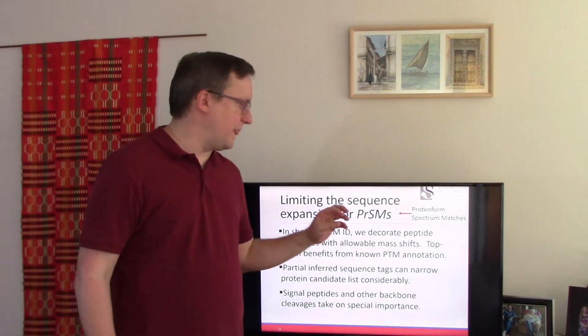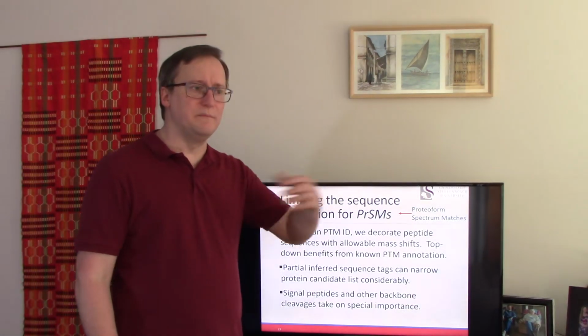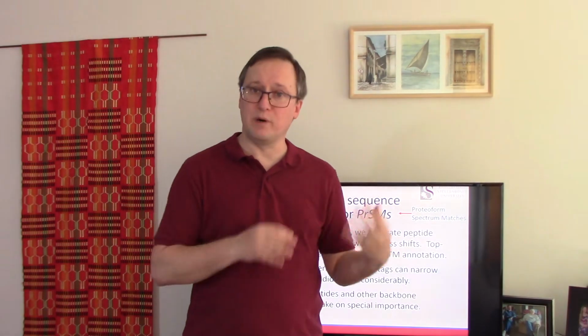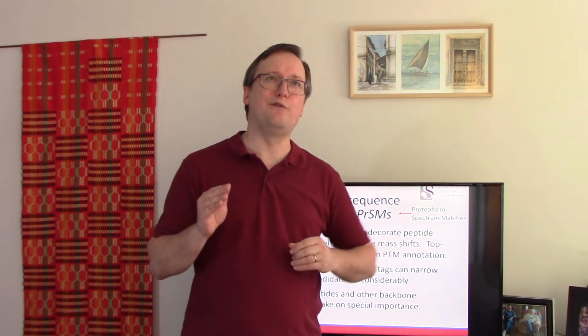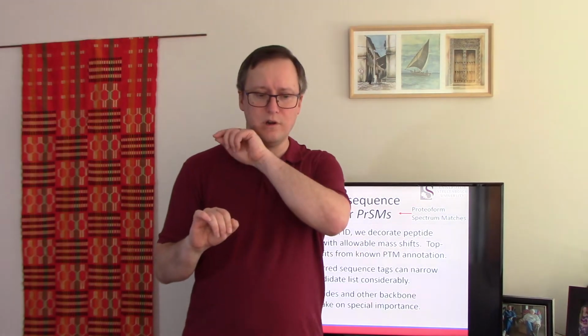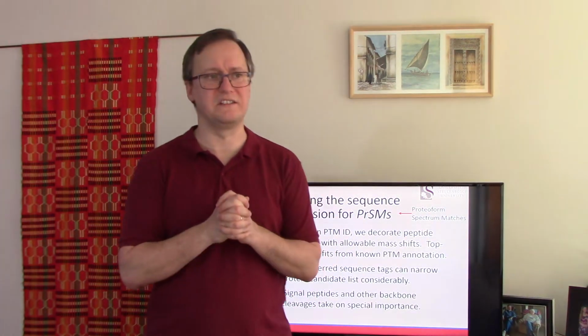All right, so that's great. We now have some notion of how to go about this. Now, if we were just adapting a database search engine for the purpose of identifying tandem mass spectra, we would simply need to allow for the software to accommodate different truncations of sequence, for example, removing signal peptides, removing initial methionine, stuff like that, and allowing for PTMs to be scattered across the amino acid sequence.